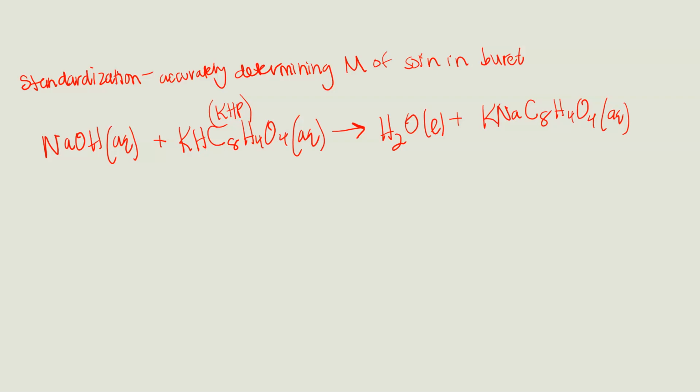In part A, our goal is to figure out the molarity of the sodium hydroxide. Now, the lab does tell us it's somewhere around 0.1, okay? But that's not accurate. That's just an estimate. So I'm going to give us a pretend scenario, some pretend data.